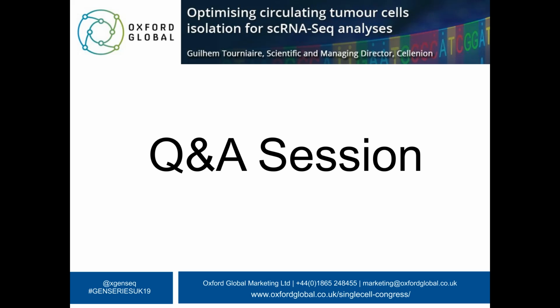Basically, out of several thousands of cells that were sequenced, they only found 1 or 2 CTCs. And when you know the cost of running the Chromium 10x protocol, it's over 10,000 euro just to get the transcriptome of 1 CTC. It's not really efficient. So very low recovery rate, low capture rate of single CTCs, and very expensive. So we don't think that this is really implementable in the hospital as a routine test.